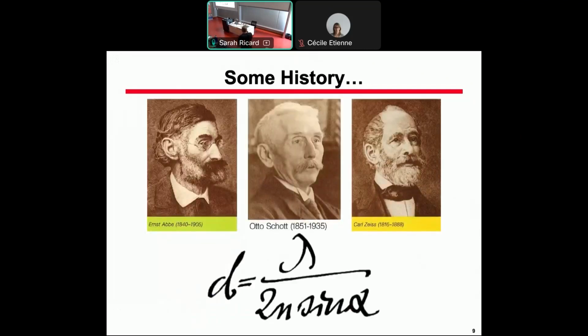In fact, at the end of the 19th century, in the history of science, it's an interesting phenomenon. It's the first time that an instrument reached the theoretical limits before one knew the theoretical limit. And because they could not make a better microscope, Carl Zeiss, who was working with Ernst Abbe already, asked him: there must be a problem.